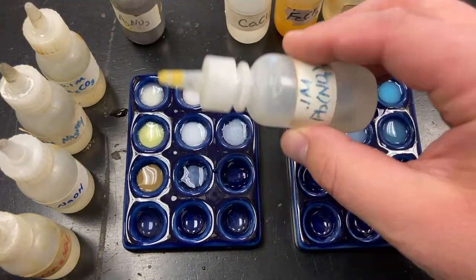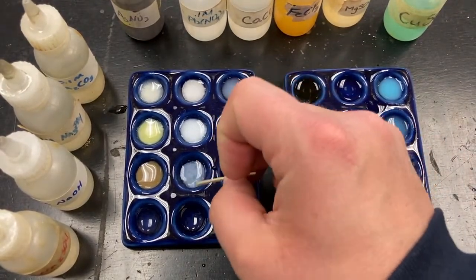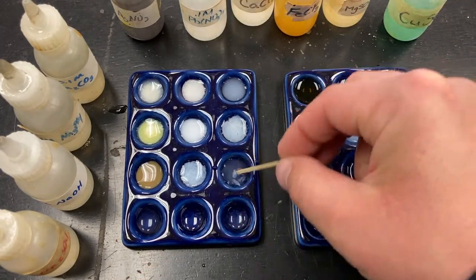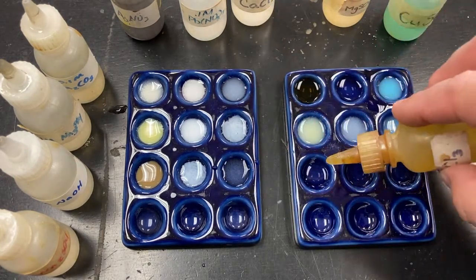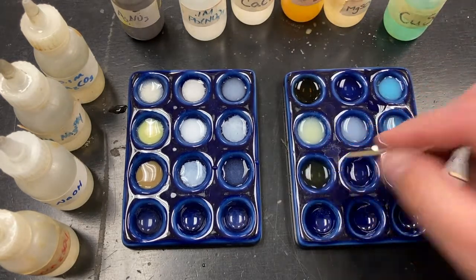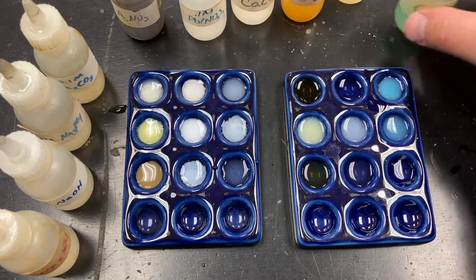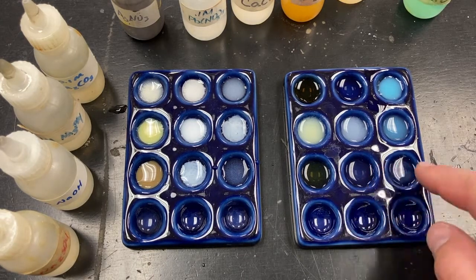Lead nitrate. Just a white flecks. Calcium chloride. It's very hard to see, very faint. Tiny little grains of solid, white solid. Iron chloride. A brown solid. Magnesium sulfate. Nothing. And copper sulfate. Nothing there either.